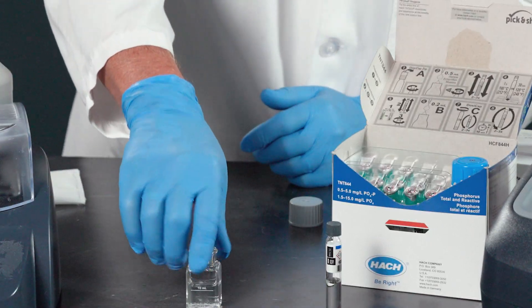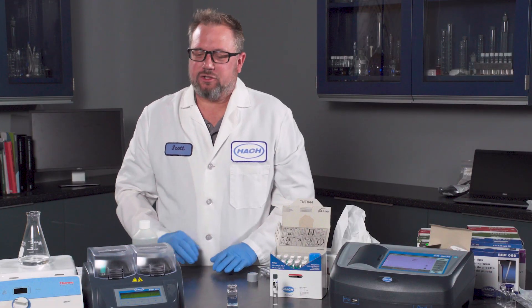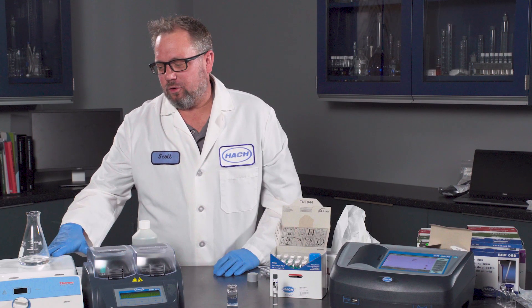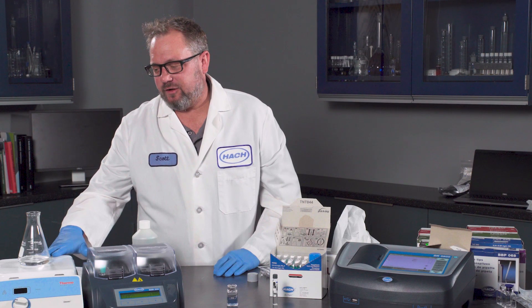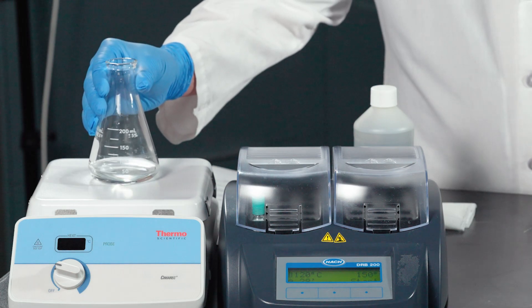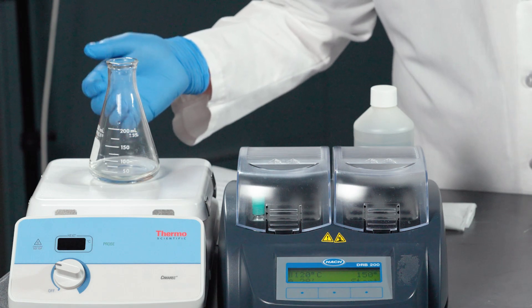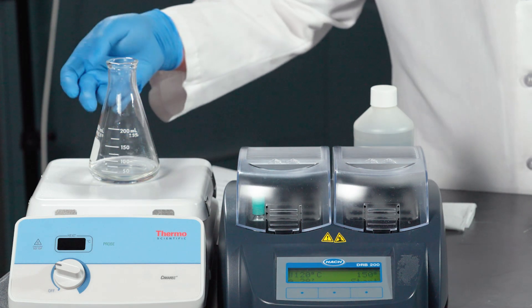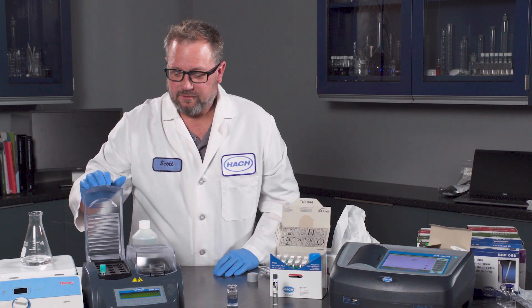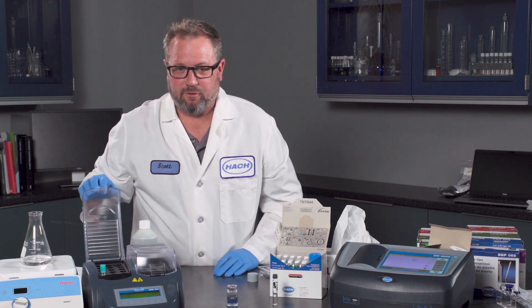It will also turn blue when phosphate is present. One issue with the PhosVer 3 method is if you want to do total or acid-soluble phosphorus, you have to use a hot plate digestion where you take 25 mL of sample, add acid for acid-soluble or a persulfate powder pillow for total. What is nice about the TNT Plus is it's all contained in a simple vial.